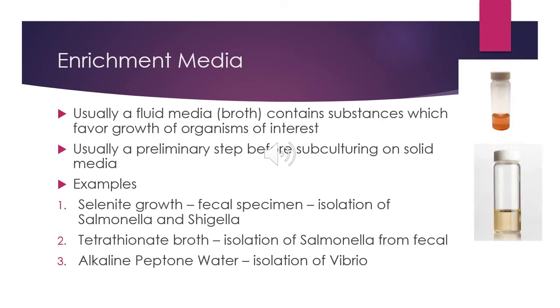When we say enrichment media, usually this is a fluid media. It contains substances which favor the growth of organisms of interest. Usually, enrichment media is a preliminary step before you subculture into solid media. What are examples of enrichment media?